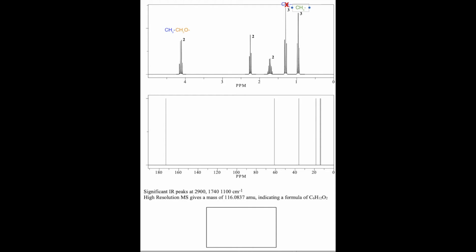Believe it or not, we can actually figure this out. If something is beside a CH3, it will be coupled into at least 4 peaks, right? Whatever the CH3 is beside, it will act as a neighbor, and there are 3 of those hydrogens, so n plus 1 is 4. It will split whatever it's next to into at least a quartet. And if you look at those two remaining CH2 peaks, one of them is a triplet, and one of them is a rather complex multiplet. And that tells me that it can't be that triplet. That CH2 triplet has to be beside less than 3 hydrogens.